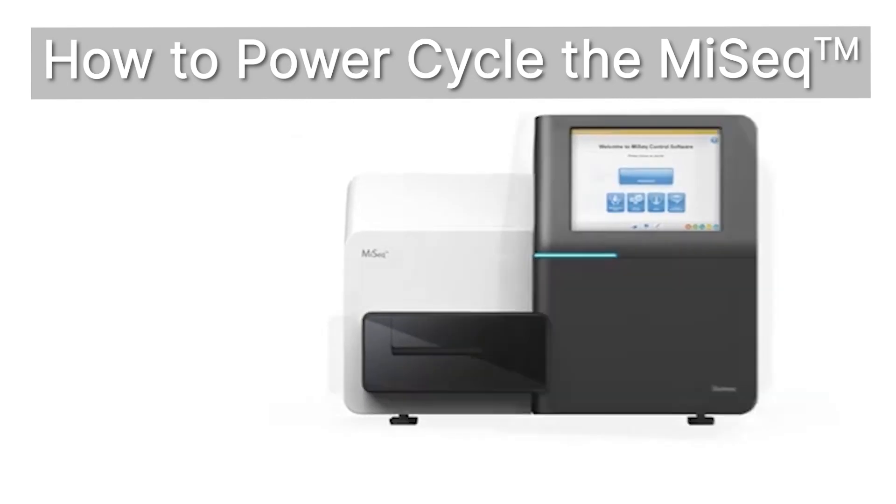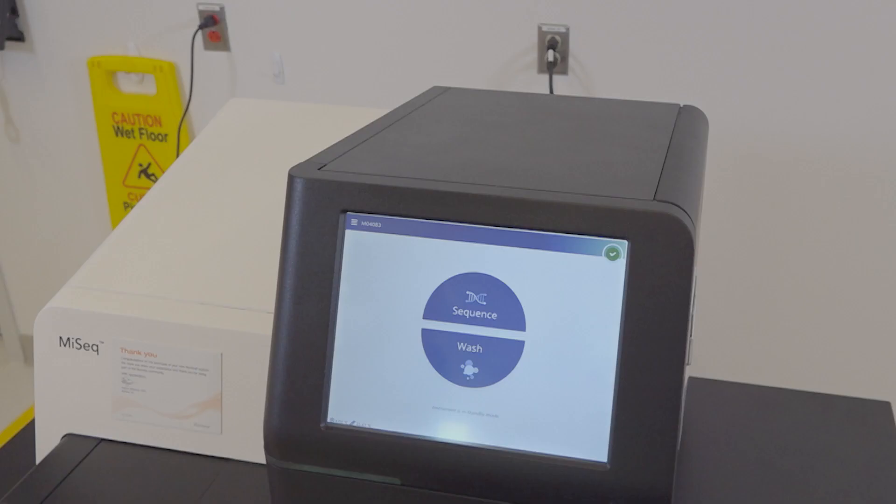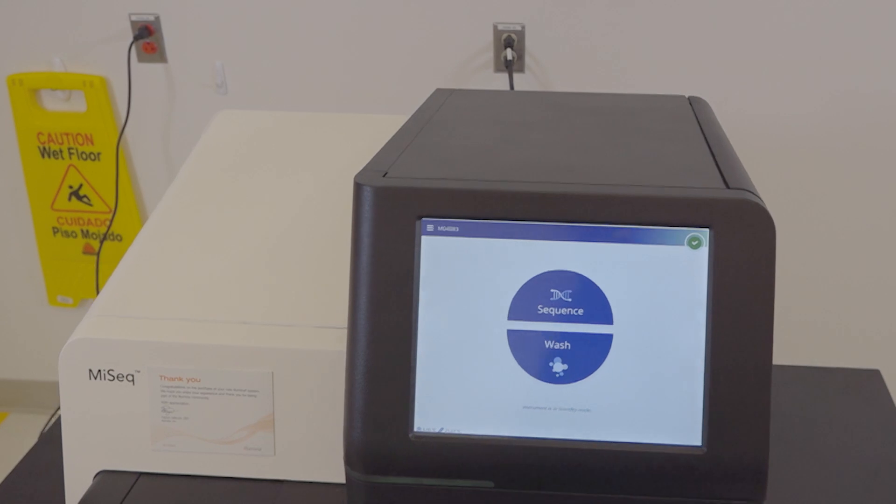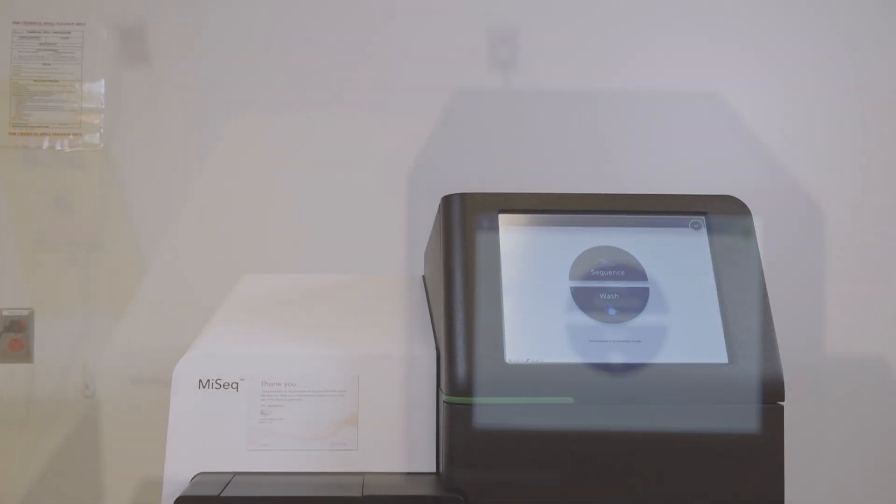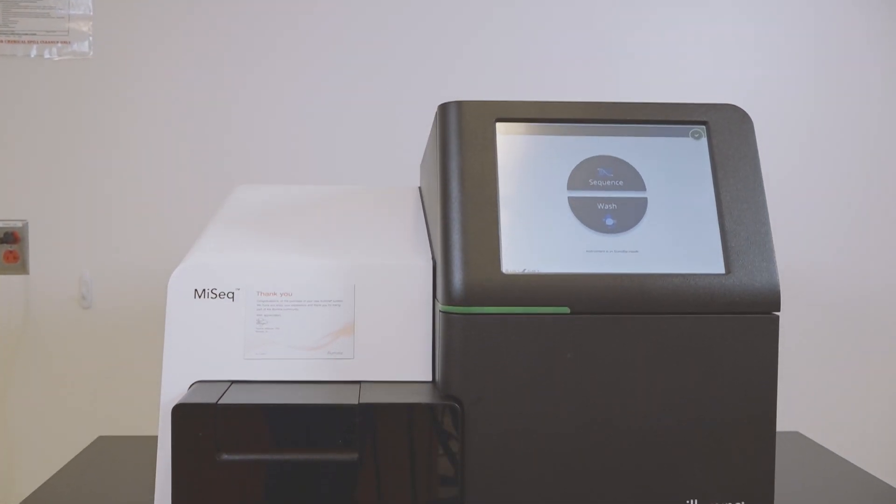How to power cycle the MySeq. We recommend power cycling the MySeq instrument once per week and as needed for troubleshooting purposes.